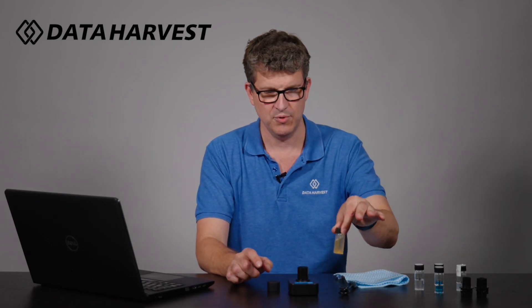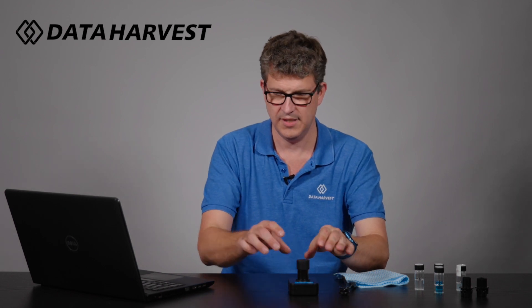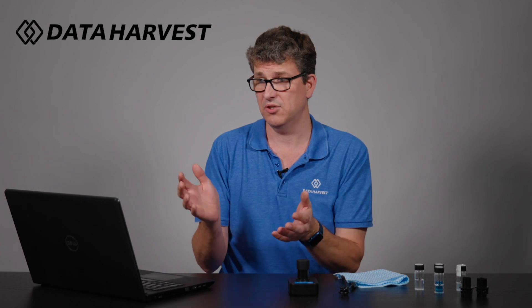And the last one — the apple cider vinegar. Agitate that a little bit, pop the lid on, and take a third reading. You can also type as you go along, so I could type 'pond water' here and you can see that appearing. And you can type 'copper sulphate'. You can see how easy it is to add comments, which students should do as they're doing the experiment.